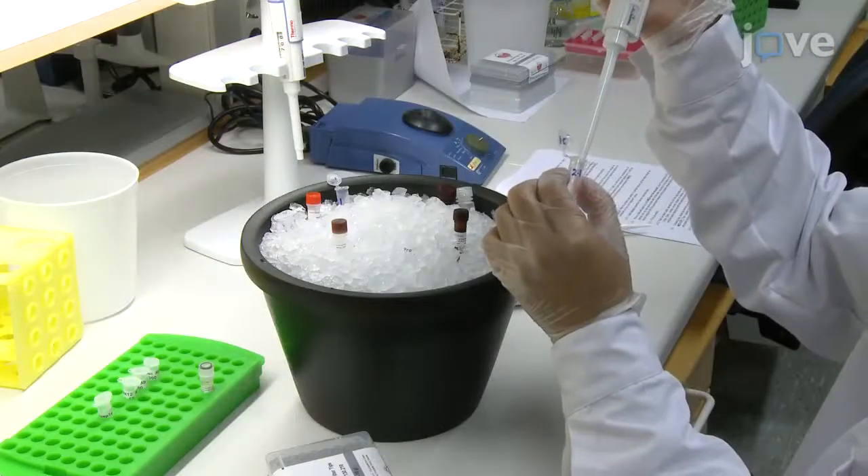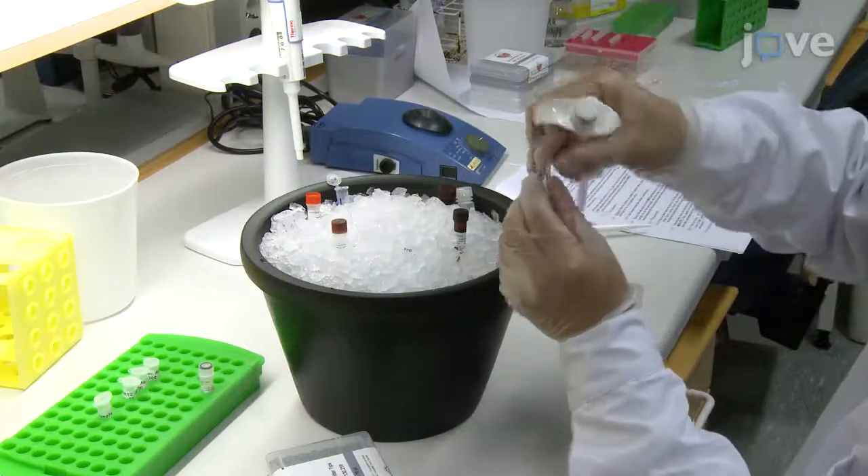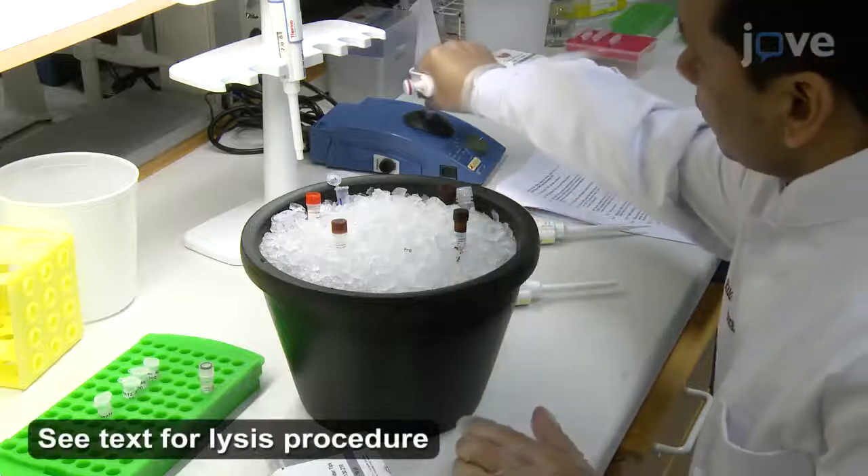Dilute previously isolated protein lysates using the sample diluent mix to obtain the desired concentrations.